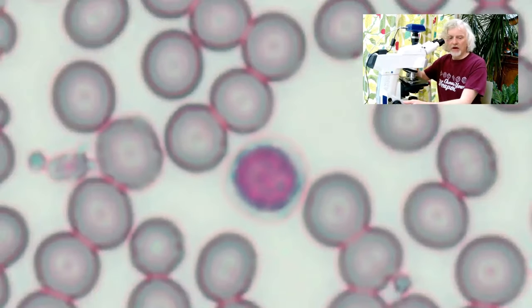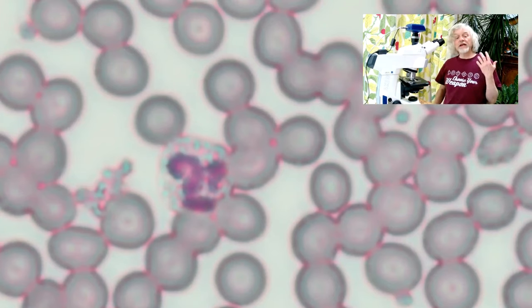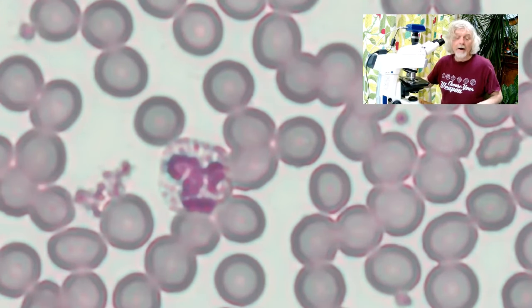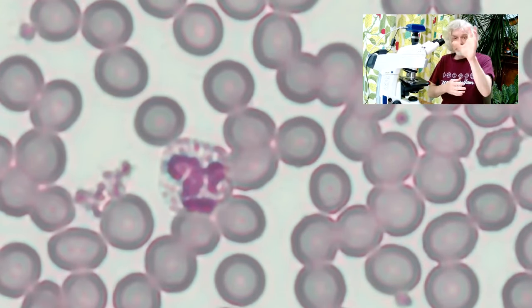There are other cells in here though. I noticed there is another type of white blood cell in this picture. Let me zoom in here. This cell here is a different type of white blood cell called a neutrophil, and it looks like the cell nucleus has been all smushed up, but that's normal. They're a bit peculiar. They've got these lobes on their cell nucleus, which is how you know it's a neutrophil. They're very distinctive, and neutrophils are the most common type of white blood cell. They go around your blood and hoover up any bacteria or fungal spores they find, but mostly bacteria. They're the vacuum cleaners of the blood.